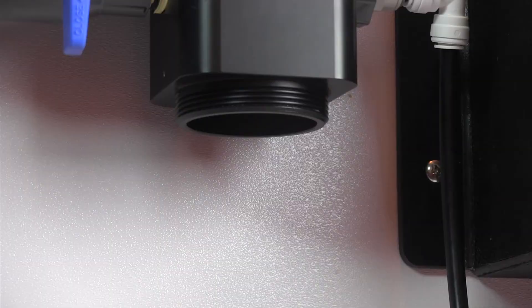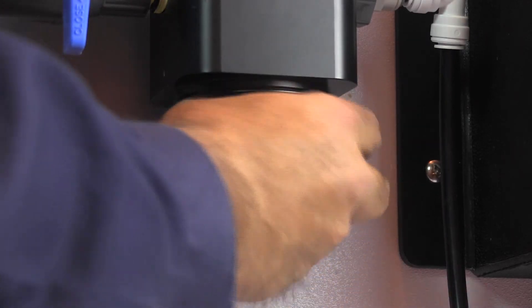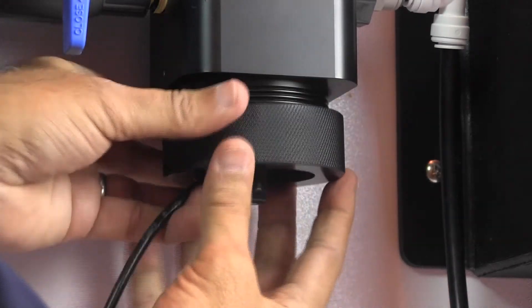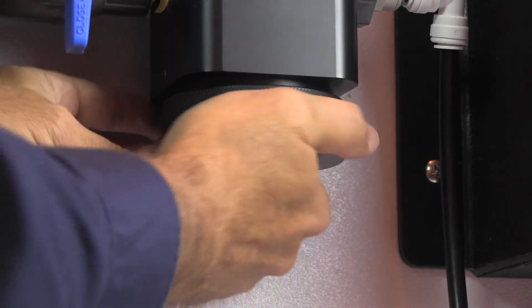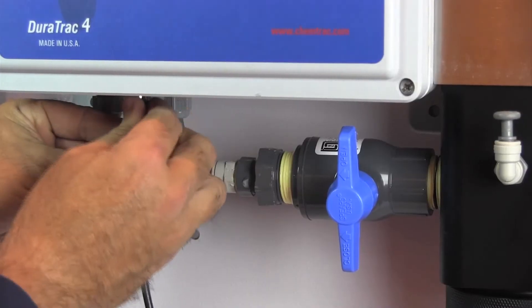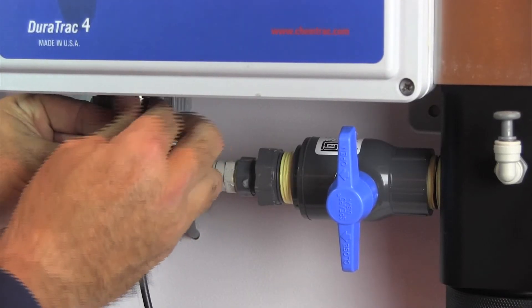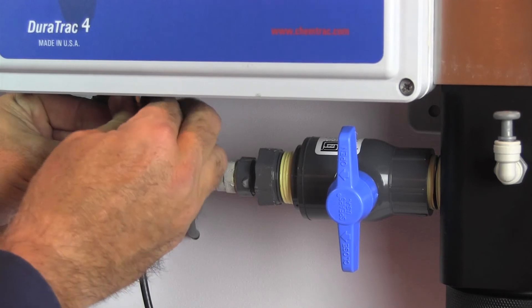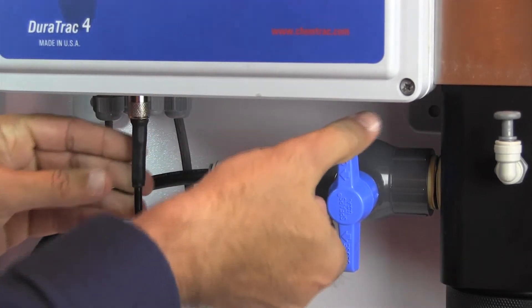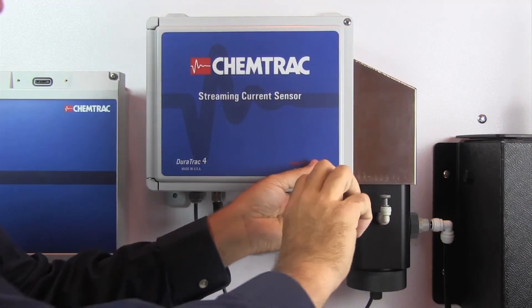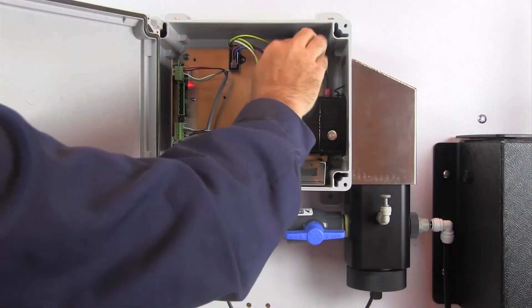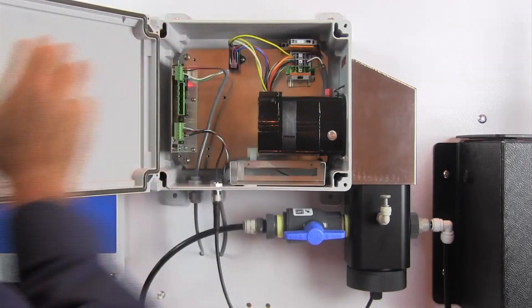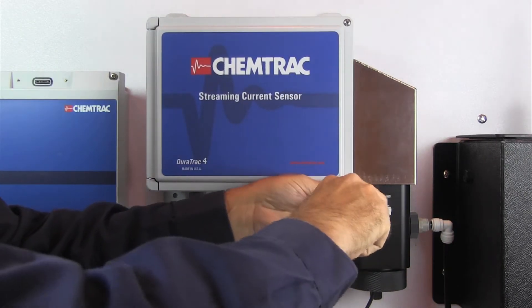Insert the probe cartridge back into the DT4 block and hand tighten the probe retainer nut to secure it in place. Connect the probe cable and re-establish the sample flow. Repower the unit and the sensor will be back online.